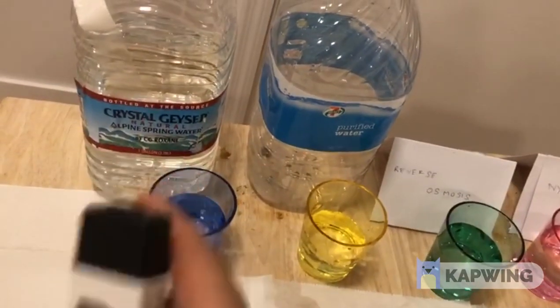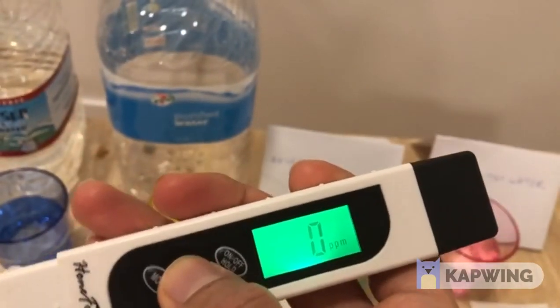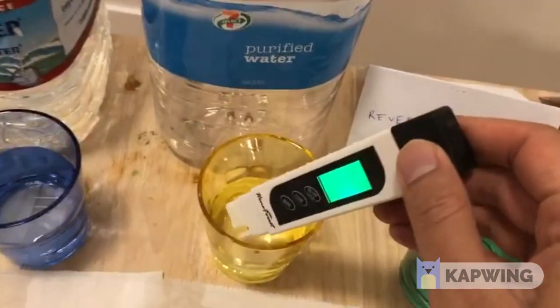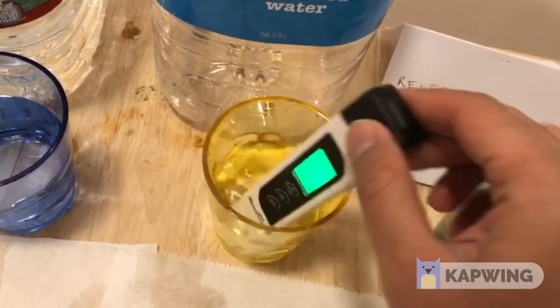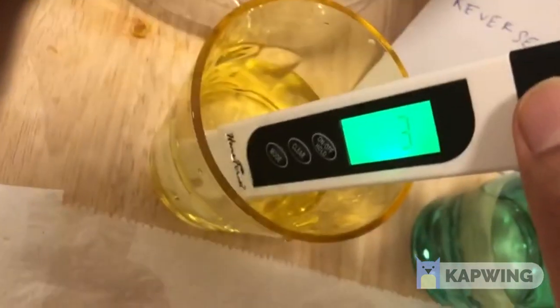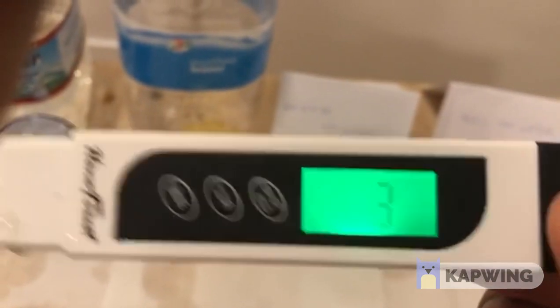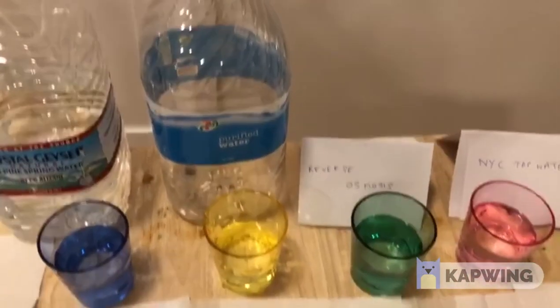So we should prefer not to drink this. Now let us look at the 7-Eleven purified water. I'll hit clear to reset the device, then put it on the 7-Eleven water and shake it to measure the parts per million. Here you can see it's three parts per million. The 7-Eleven water is just three parts per million — this is very pure, high quality water that you can safely drink.